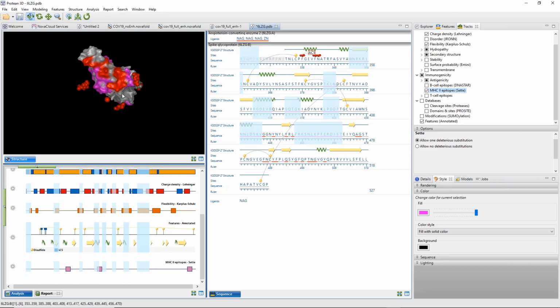And so these are the main tools I wanted to show you guys today. I think I'm running out of time. I think I have 2 minutes left. So I think we're going to have to break for questions soon.